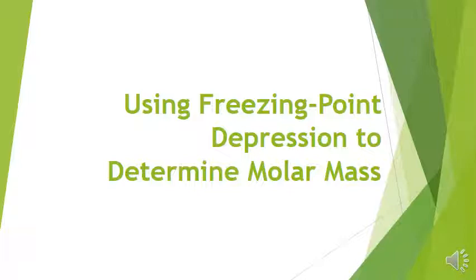Okay, for this lab demo, I've used the freezing point depression formula to figure out the molar mass of benzoic acid. There's a quiz about it. You're going to watch the video, then do the quiz, and then I also want you to send me a worksheet, basically a table, with the tables and calculations.